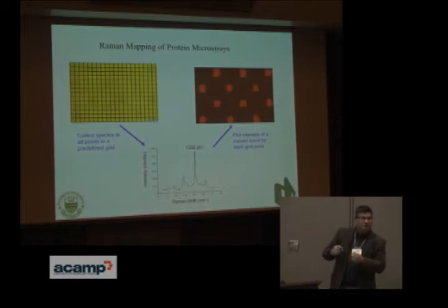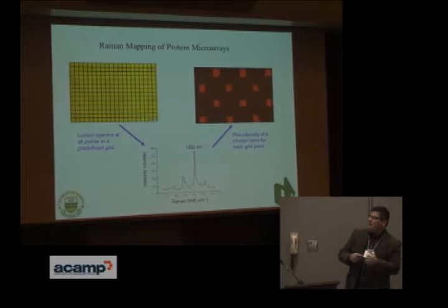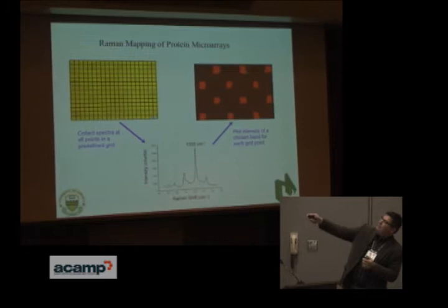As you can imagine, this is fairly slow, but there is instrumentation out there that's starting to speed up this mapping to the point where it's a half hour to do the whole map. And so this then would be the map of our interactions based on this surface enhanced Raman detection.